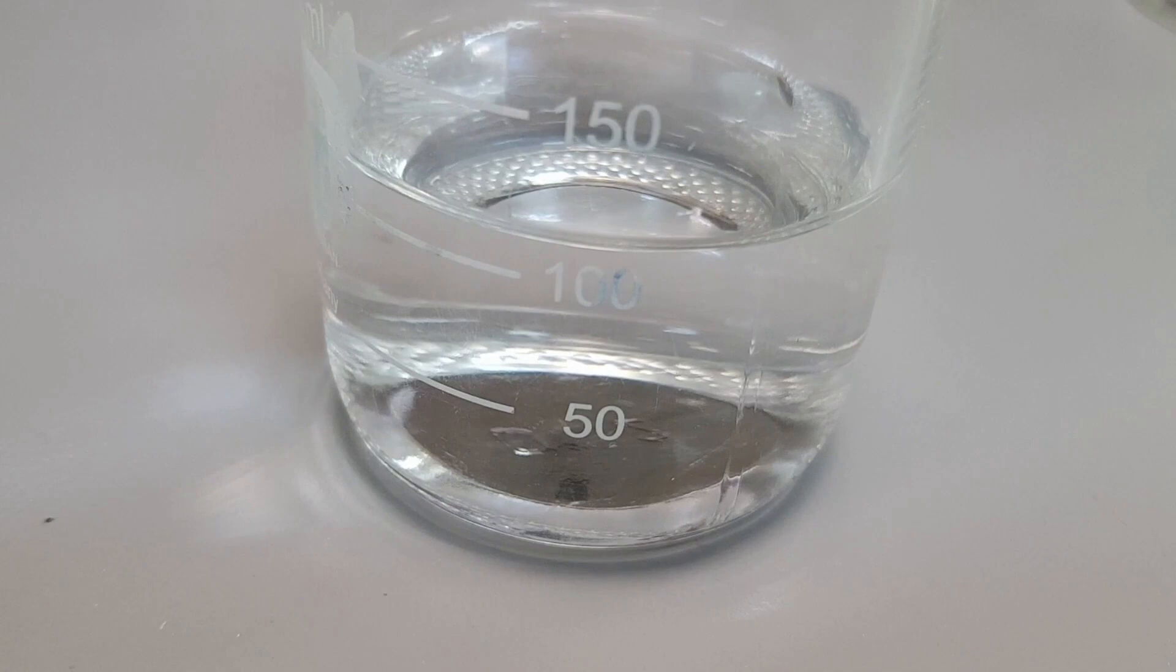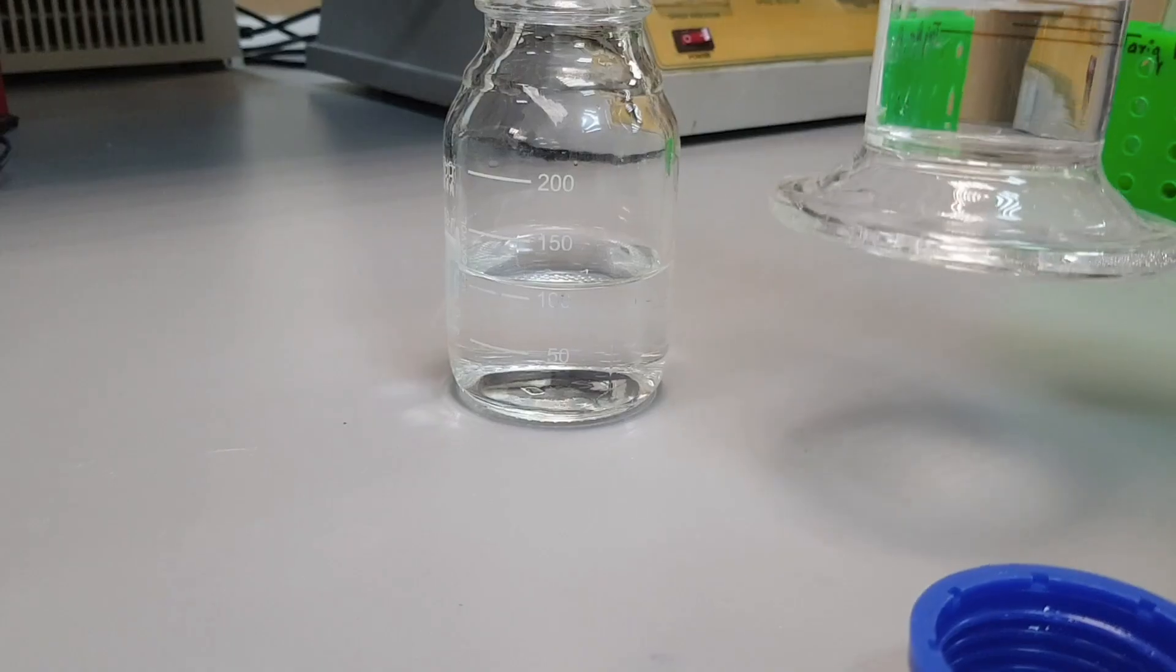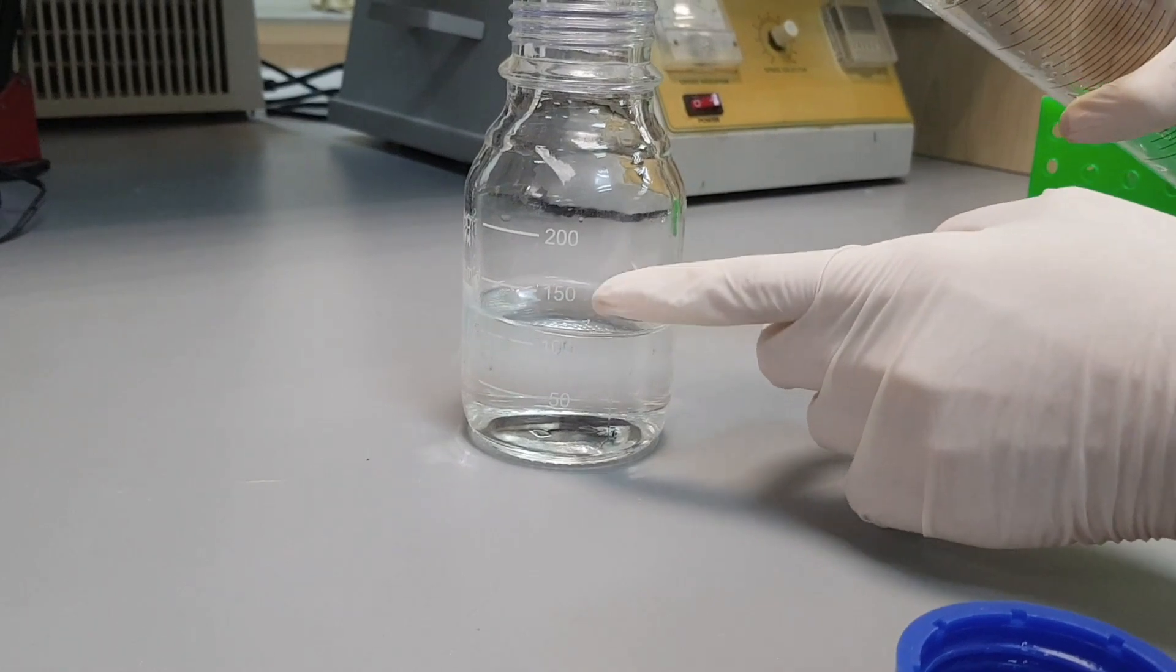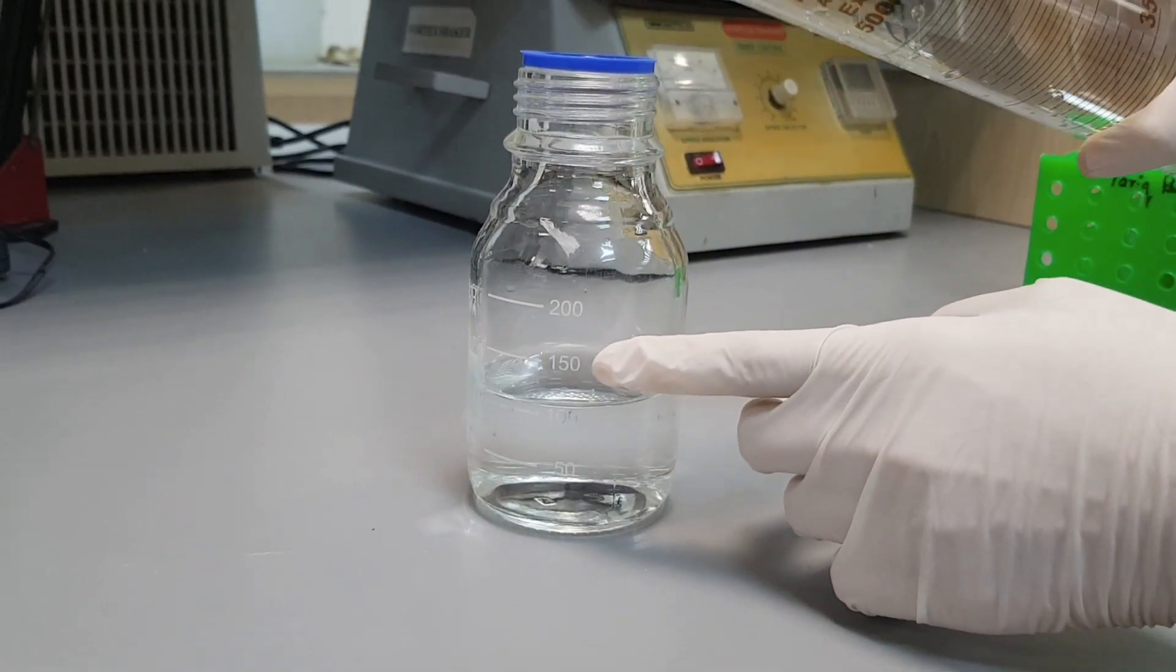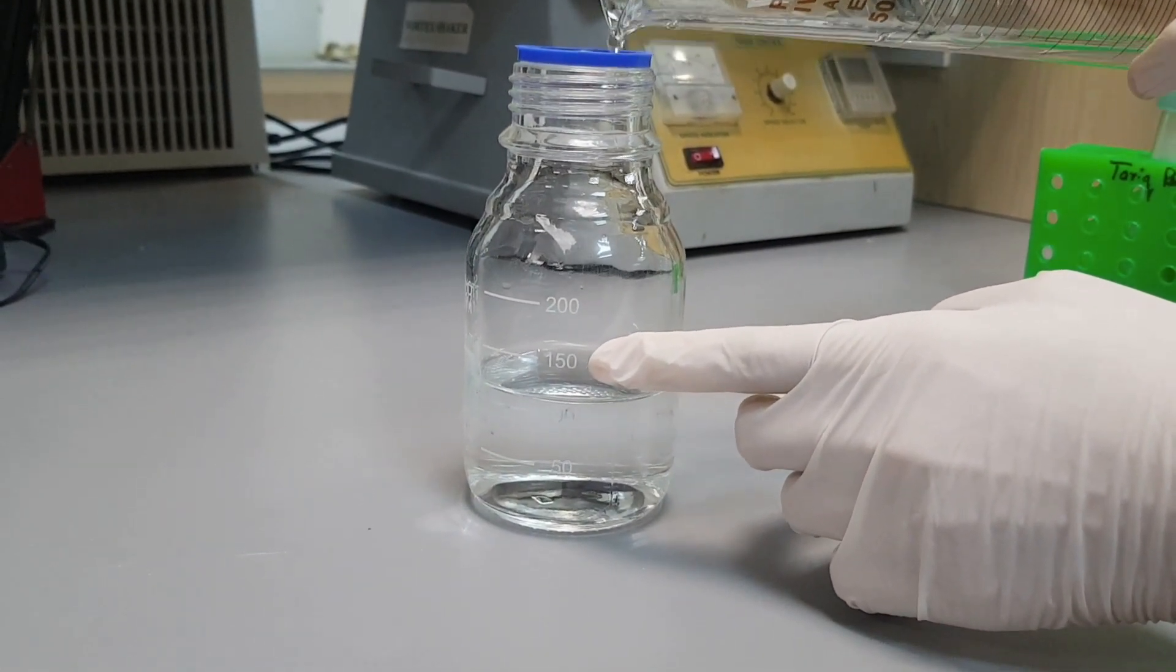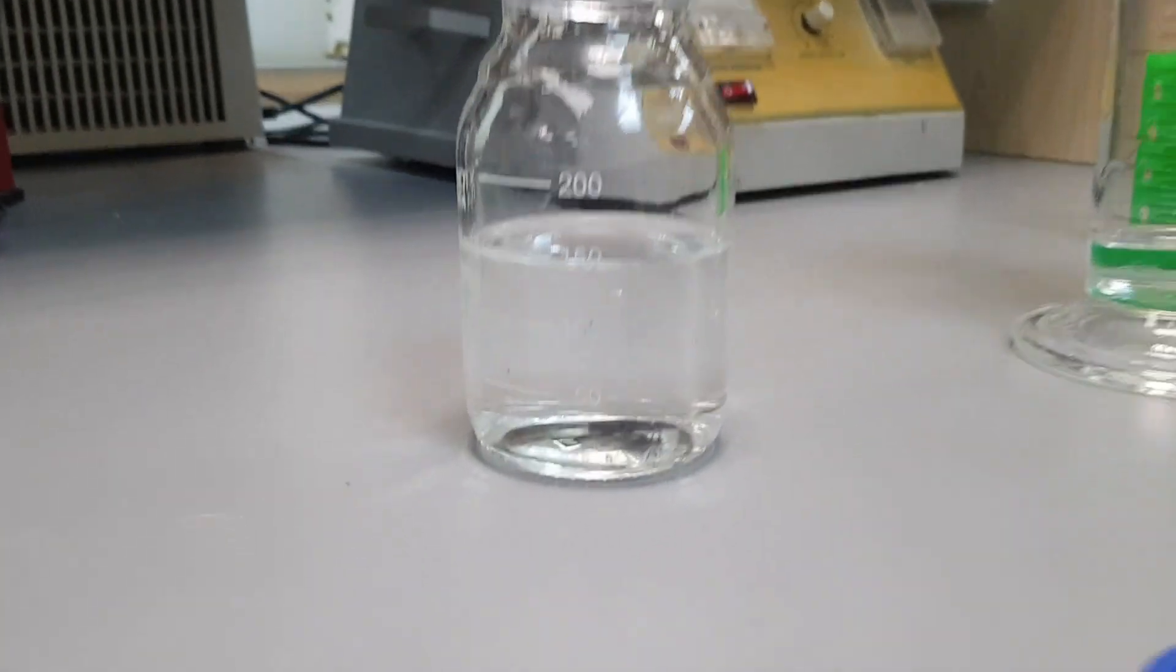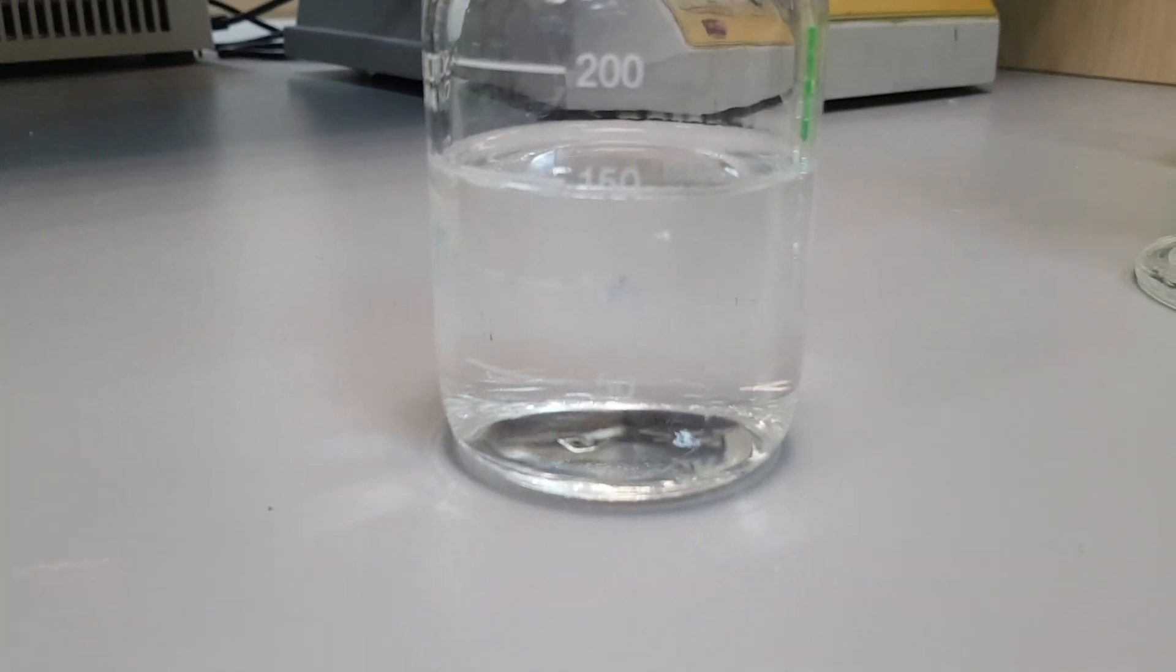Mix the reagents well by gentle shaking until all the ingredients are well dissolved and look transparent. Now check the pH of this solution by using a pH meter and maintain its pH at 7.5 to 7.6. Once the pH is maintained, make the final volume of this solution to 150 ml.